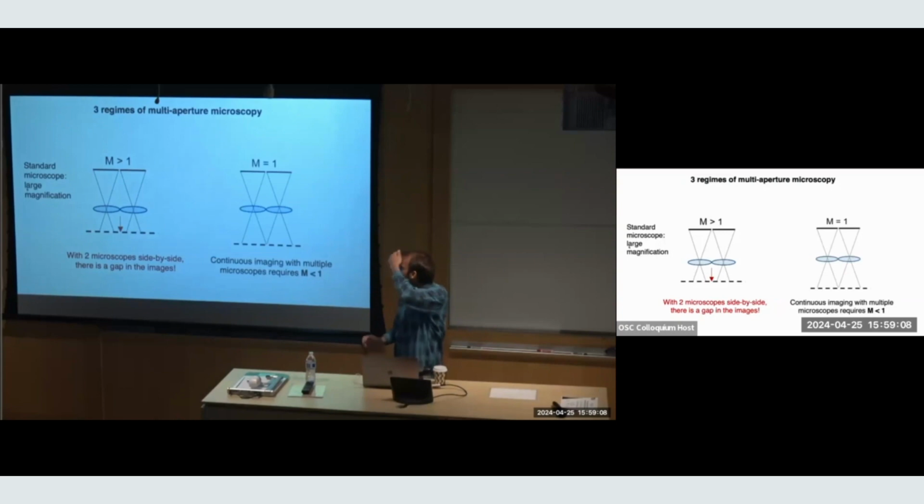And so what you really need to achieve is high resolution imaging in a regime where your magnification isn't greater than 1, right? So it's 1 or below. And in this regime, your pixel size really starts to matter. Basically, the best resolution you'll be able to get with a magnification of 1 is simply mapping your pixels into the real space. So it's going to be your pixel size of, let's say, 5 or 10 micrometers historically that would define your resolution if all of your optics were perfect. And that isn't great for microscopes, et cetera. And that's an ideal case. It's tough to get these image sensors directly next to each other and all of that.